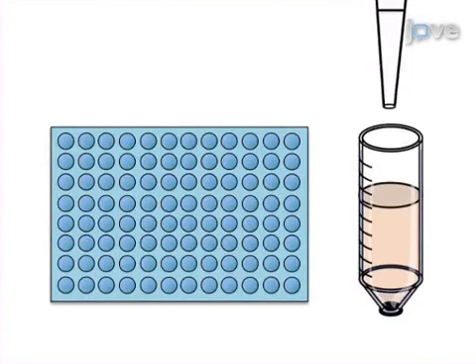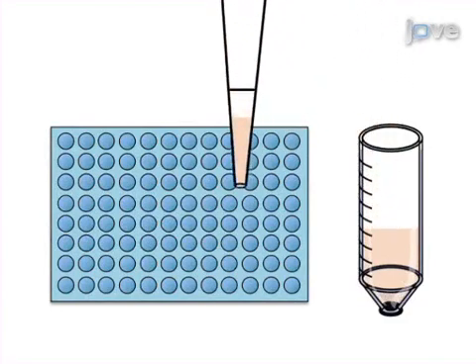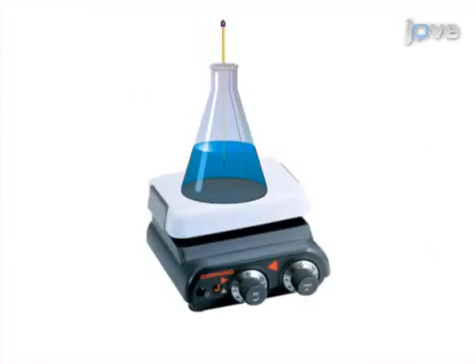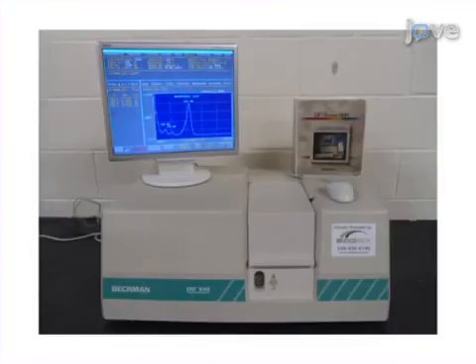This is achieved by first plating mast cells into a 96-well plate to allow them to attach overnight, and preparing Triclosan in an aqueous solution without the use of organic solvents via heating. The concentration of the Triclosan solution is then rapidly determined using ultraviolet visible spectroscopy.